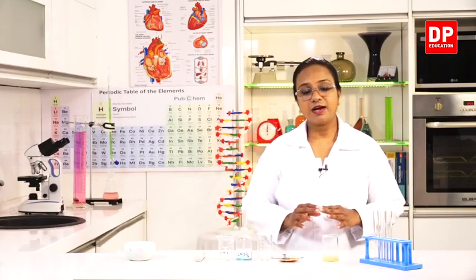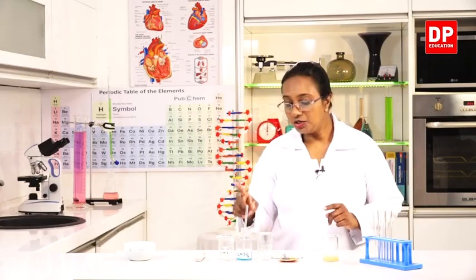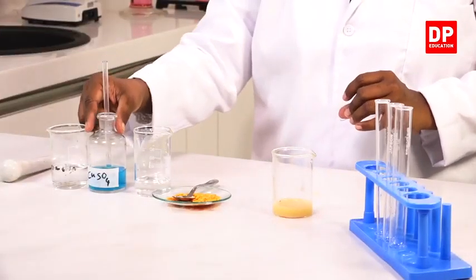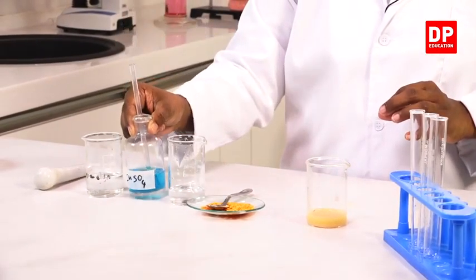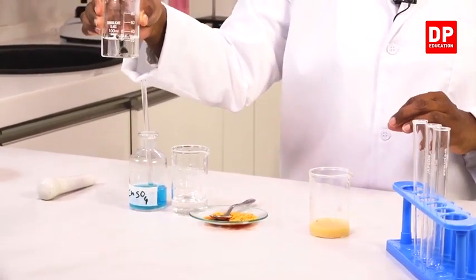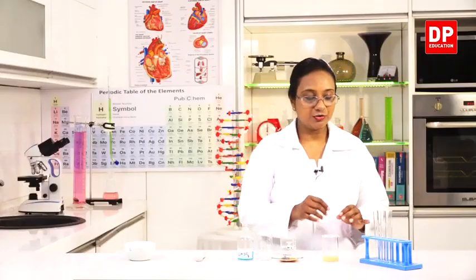Now we are going to do the test to identify the proteins present in the dal solution. For that, I'll be needing two reagents. You all know the reagents. This is copper sulfate. Copper sulfate is blue in color. It is a nice blue color solution. And sodium hydroxide. First, we will need the sodium hydroxide solution.